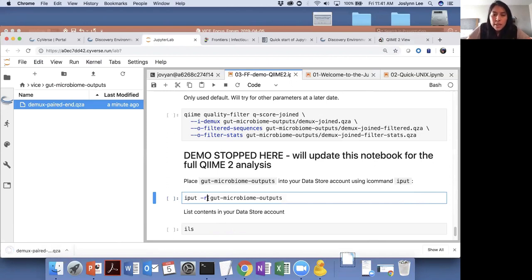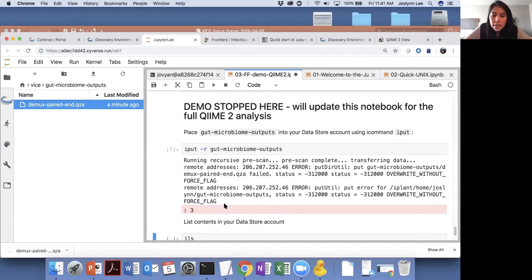So if I put output, run that. Okay, we'll come back to that in a second.